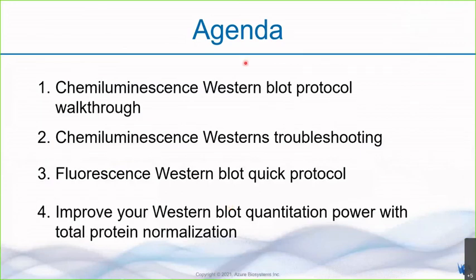These are the agendas for today's session. Firstly, we will walk through the chemiluminescence Western blot protocol, look at the troubleshooting tips for Chemi Westerns, take a quick glance at the Fluorescence Western blotting protocol, and finally, how you can improve your Western blot quantitation power with total protein normalization imaging.